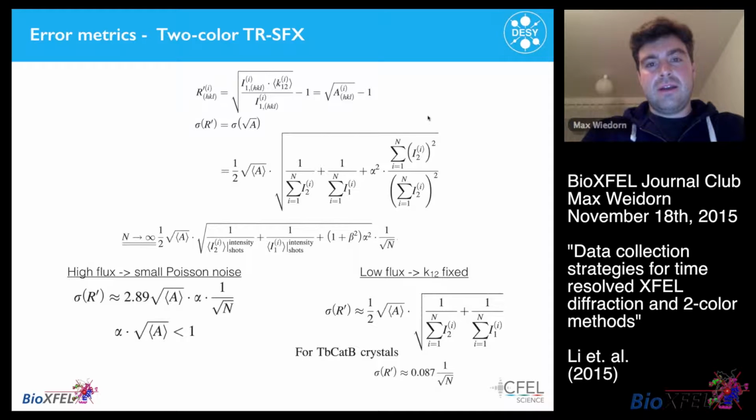That leads to a rock solid K, but the overall flux will be a lot lower because you have several mirrors to have the split and delay stage in there. So based on that, your error will be dominated by Poisson noise on the detector.